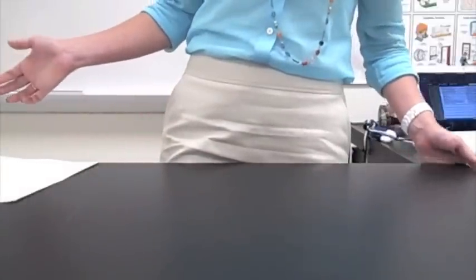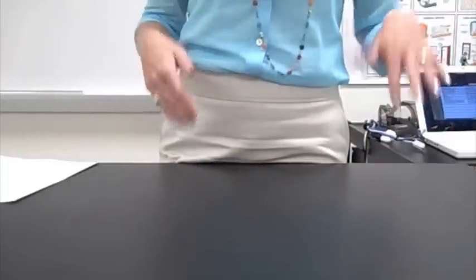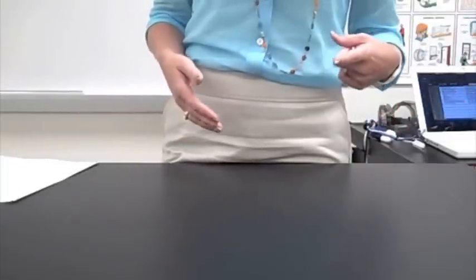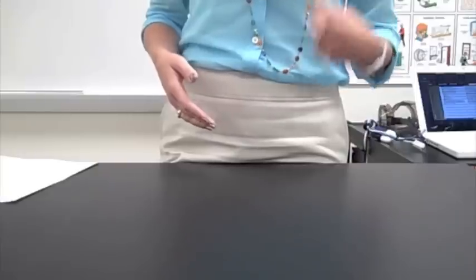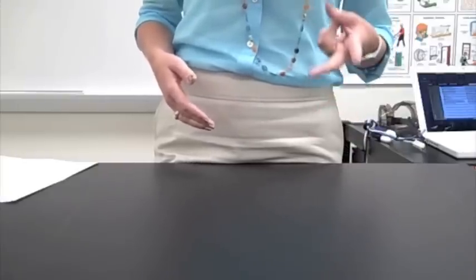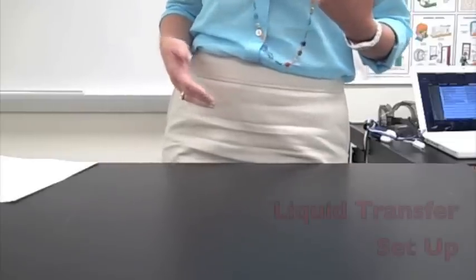Alright, so here is your very first lab of the year. We're going to start with a blank space and put all of our stuff in it. You're going to get your own stuff, and I'm going to walk you through what it is that you need to do. Your pre-lab is just to simply write down what materials and chemicals we're going to be using, and then also to write down whatever safety precautions you think need to be followed for this lab.